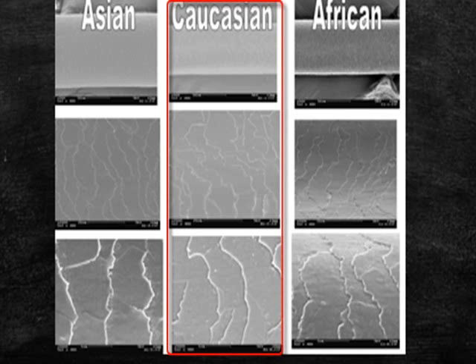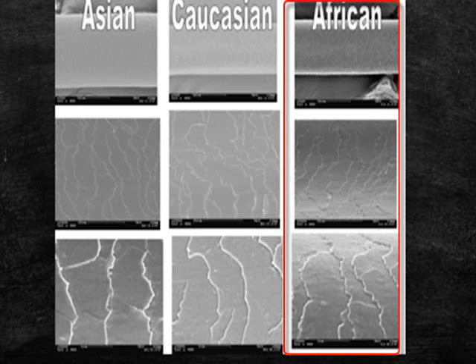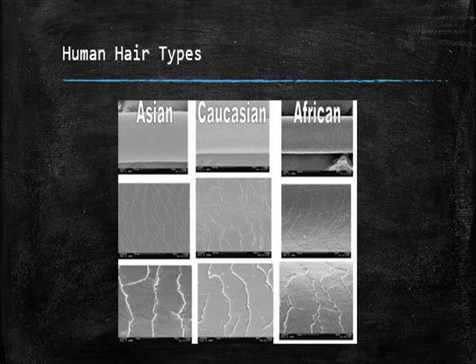Caucasian hair is usually straight or wavy, ranging from blonde to brown to black, and usually fine or medium coarseness. Caucasian hairs often either lack or contain a fragmented medulla. African hair is often curly or wavy in appearance. African hairs contain the largest pigment granules of all three types of hair. The medulla is either lacking or fragmented in African hair.